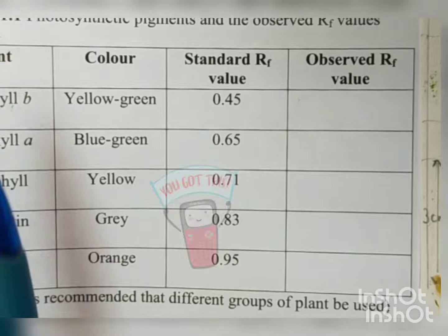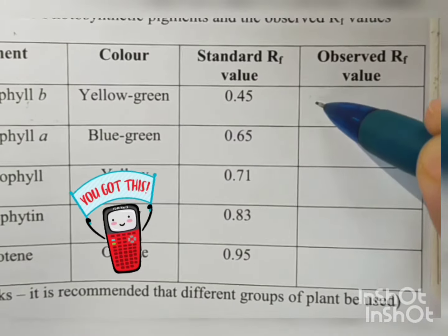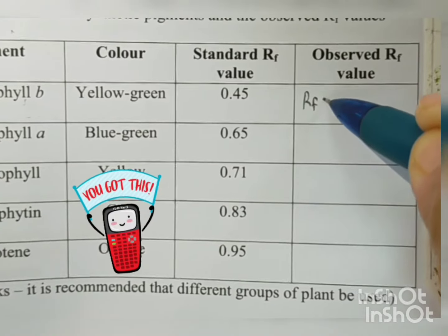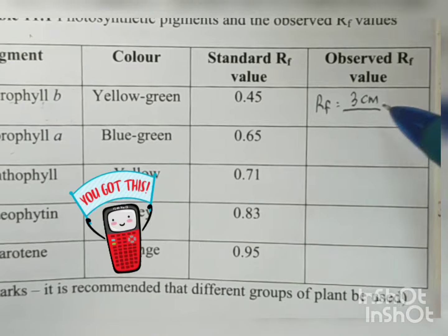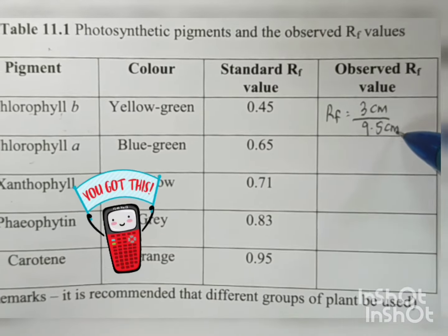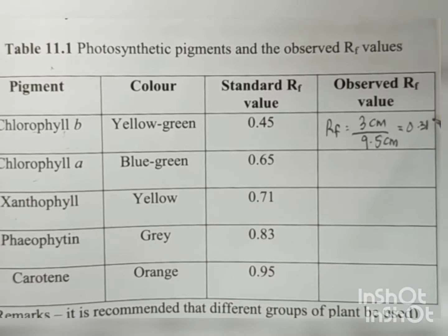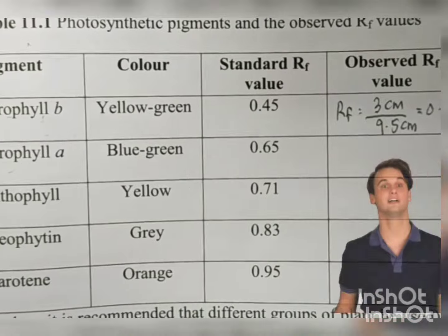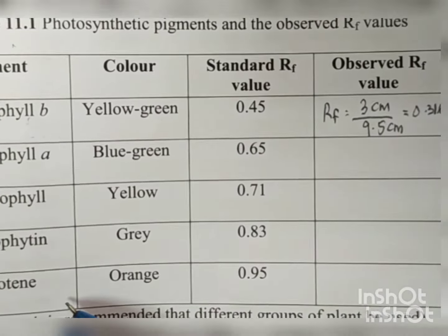So, the observed RF value for chlorophyll B is equal to 3 cm over 9.5 cm, which is equal to 0.316. Repeat the calculation for the rest of the photosynthetic pigments.